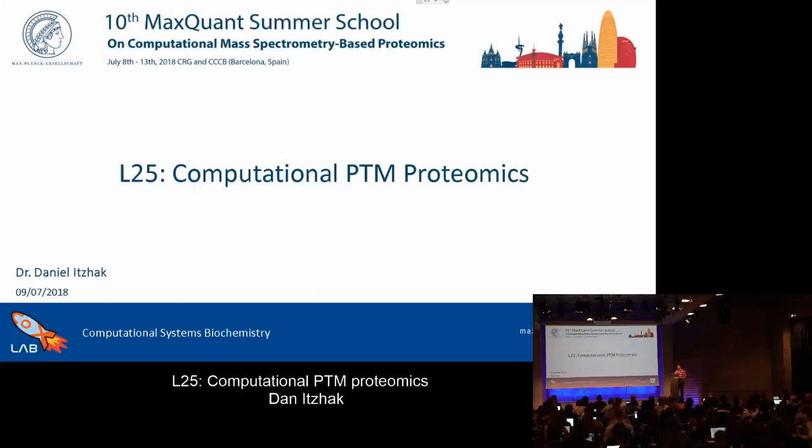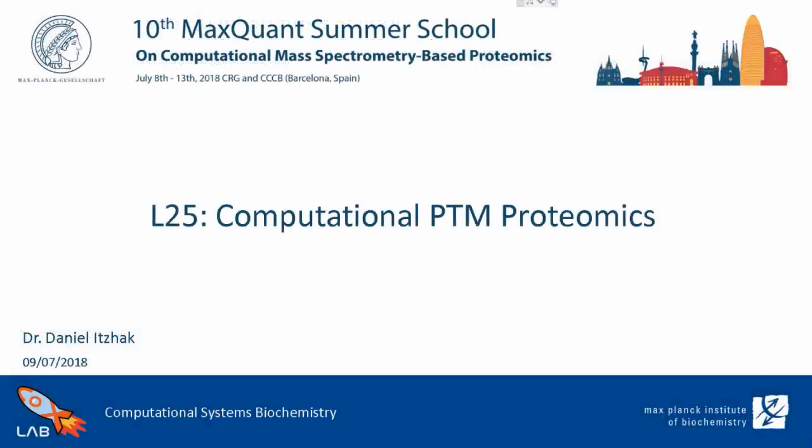So this talk is about computational PTM proteomics. I guess there are a lot of people in the room that have done some standard proteomics, some full proteome expression, and this PTM stuff is just a whole other level of difficult. From the beginning to the end, everything is just more complicated.